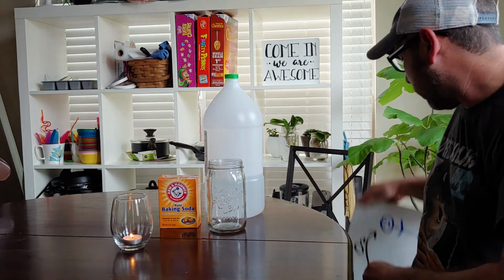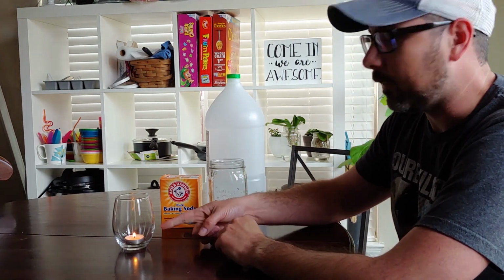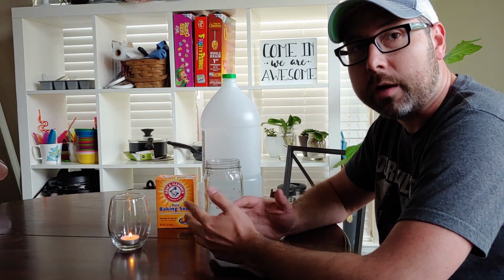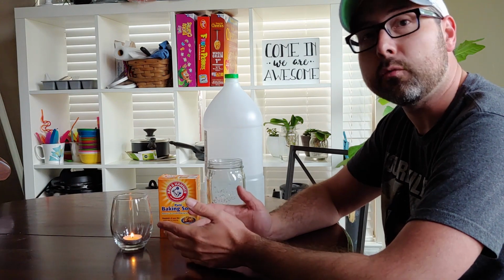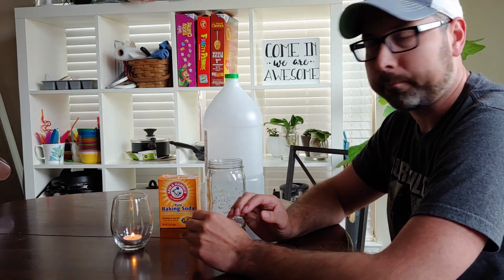So we're going to do an experiment that relates to that. Now, I thought about putting myself in a giant glass jar and testing my ability to survive without oxygen. However, I wanted to live. So instead, I'm going to use this flame. Now, why am I using a flame instead of an animal or a human? Well, a flame does a very good job of mimicking what humans do in this process, which is it consumes oxygen just like we consume oxygen. So that flame right now is burning. It's consuming oxygen from the air.